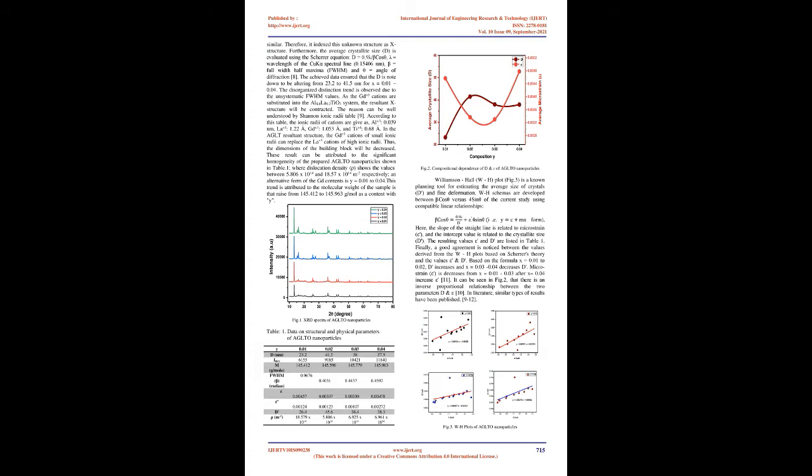Then, the autoclave was cooled to room temperature, followed by the removal of samples from the Teflon bowl. Accordingly, the sample was washed a couple of times until the pH value of the sample reached 7. In addition, using the hot air oven, the sample was dried for 120 minutes at 60°C.